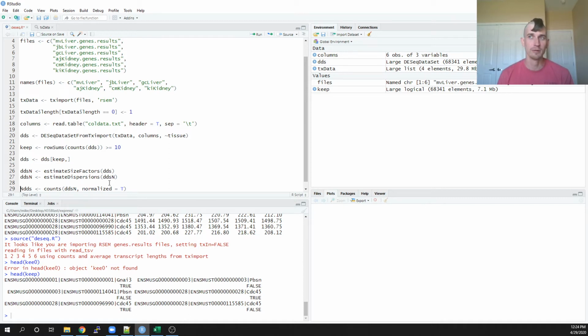But before we do differential expression, we will normalize those raw counts because our libraries are constructed a little bit differently. The sequencing depth of our libraries is different, and how they're prepped. These are not necessarily standardized libraries. We just picked them off of the internet.